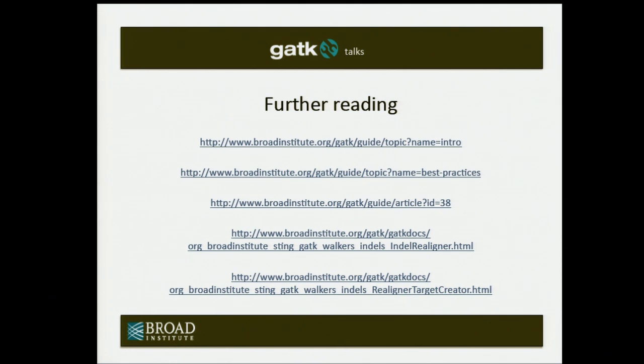Is there an upper limit on coverage that you can handle with the realignment? How much memory does your machine have? So the question was, is there an upper limit of coverage you can handle? Theoretically, if you can provide unlimited memory and compute, then no, there is no limit. But practically, if you're talking about a couple of gigs, we say the target is really 30 to 60x. It can handle a lot more than that. I think for the 1,000 Genomes project, we used to realign by cohort, which is 100 samples. Is that right, Ryan? 200 samples at 4x. We're talking about 800 reads there potentially.